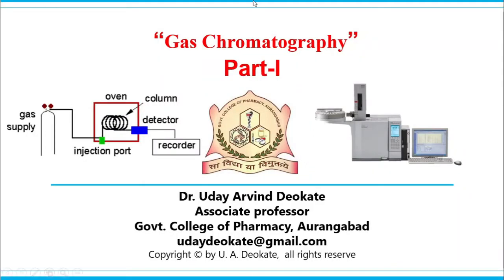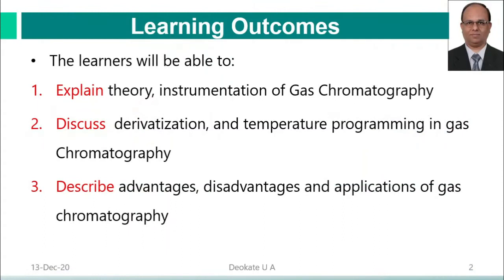Today we'll start with our next topic, that is gas chromatography. The learning outcomes: the learner will be able to explain theory and instrumentation of gas chromatography, discuss derivatization and temperature programming in gas chromatography, and describe advantages, disadvantages and applications of gas chromatography.